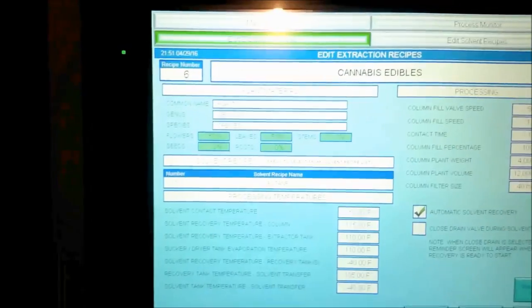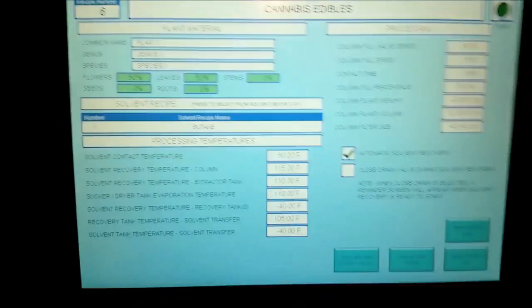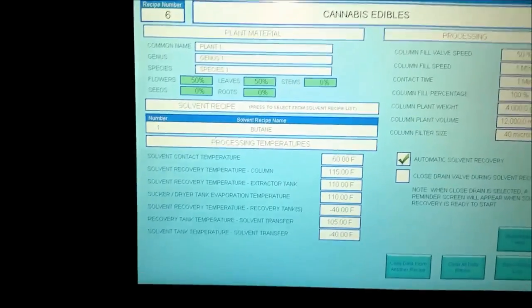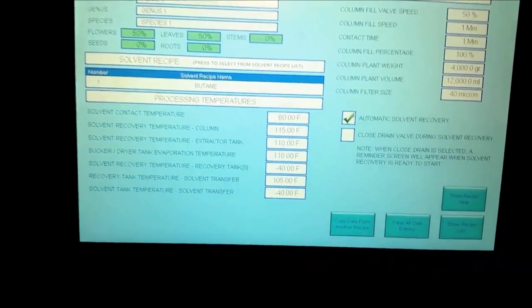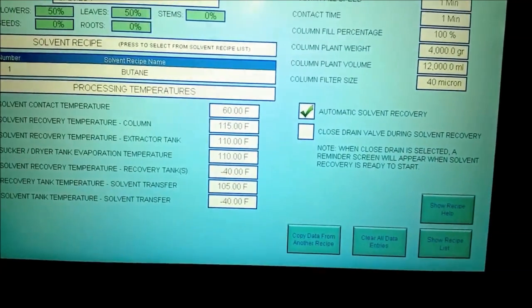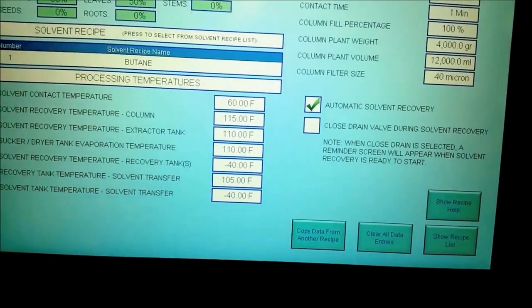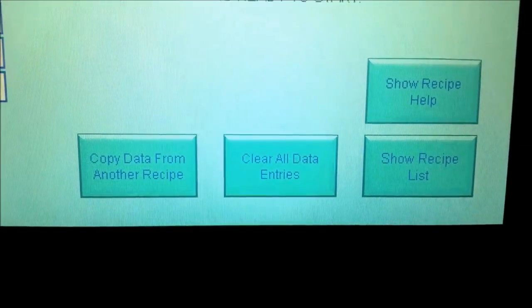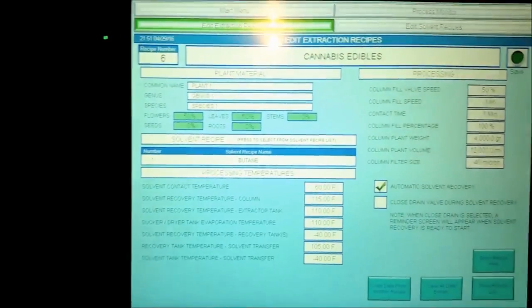Go back over to extraction recipe and now you can import that solvent into this recipe by clicking that area and it'll change it. Set up for automatic solvent recovery, or you can stop the recovery process so that you can monitor it. And see all the extra buttons here for loading pre-loaded data for a previous extraction.